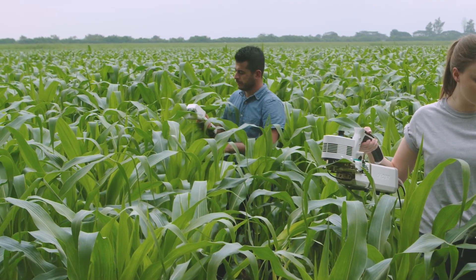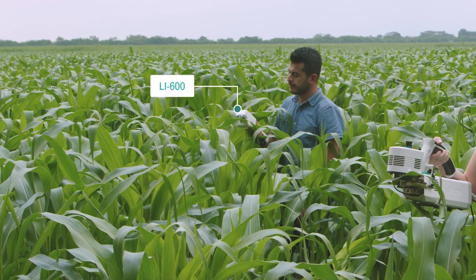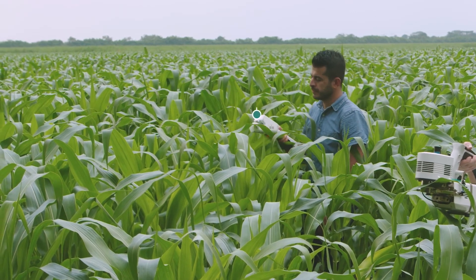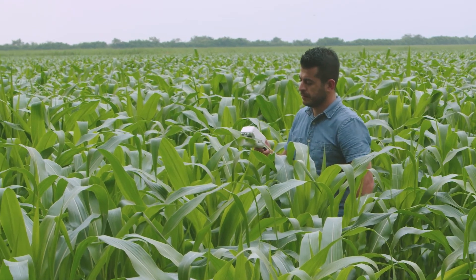Study your plants without feeling overwhelmed yourself. See how the LI600 Porometer Fluorometer can help you achieve fast, precise stomatal conductance and chlorophyll fluorescence measurements right in the palm of your hand.